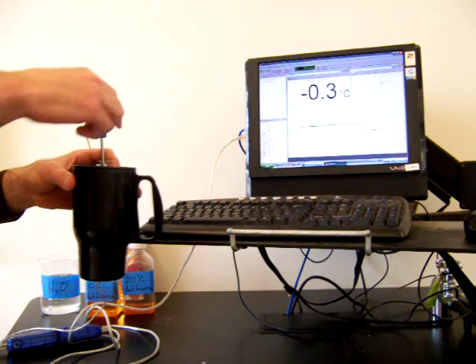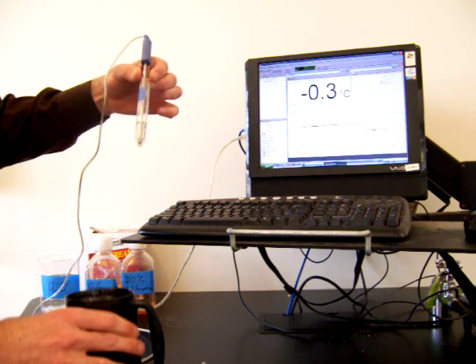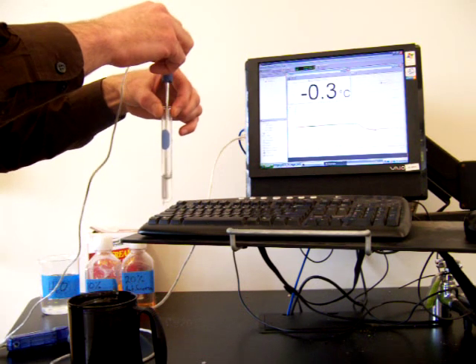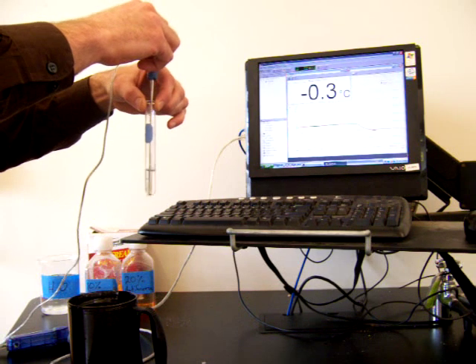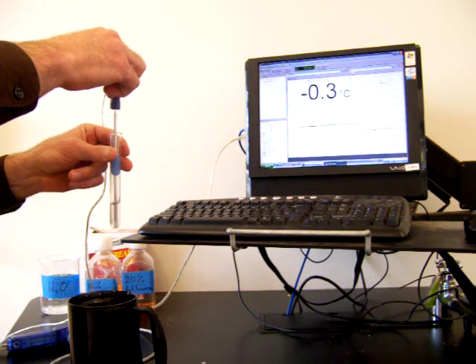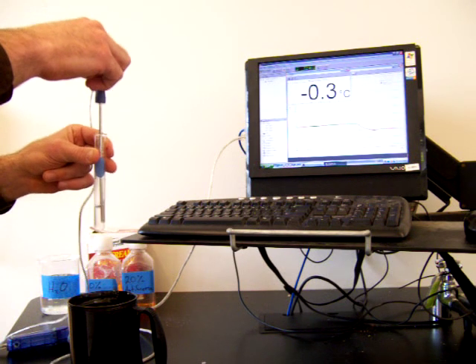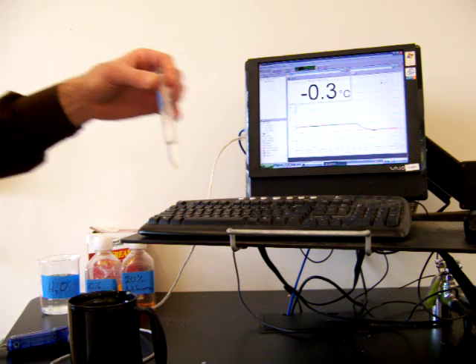And if you can see on the graph here, it dropped down a little below the freezing point of water and then came back up and it's now freezing at a temperature of negative 0.3 degrees Celsius. So that's the freezing point of our pure water. A little lower than what we would expect, but we're going to use that data anyways. And we'll see how much the freezing point of the antifreeze solution differs from that.